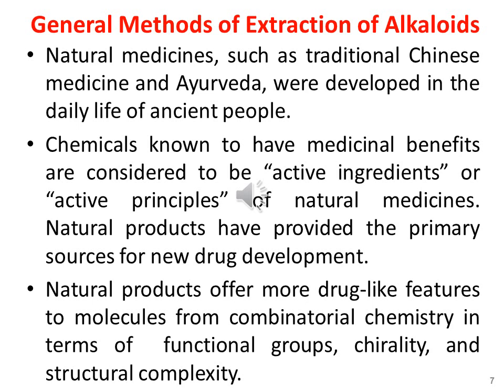That is why people have developed efficient extraction methods for the isolation of biologically active compounds from plant material. In this lecture we will study the general methods for the extraction and isolation of alkaloids from plant material.